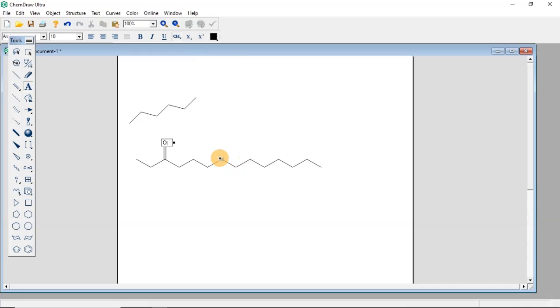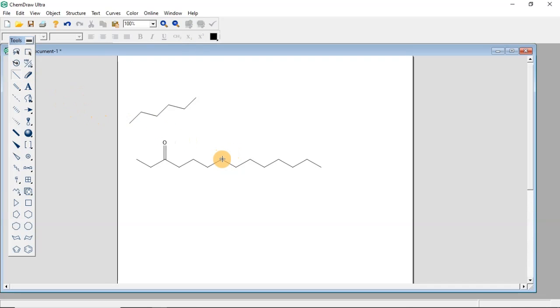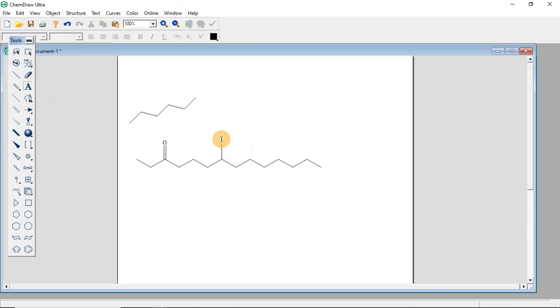If you want to insert an alcohol, extend the chain here, then come to the tip, select the text tool, and type 'OH'. That is an alcohol.